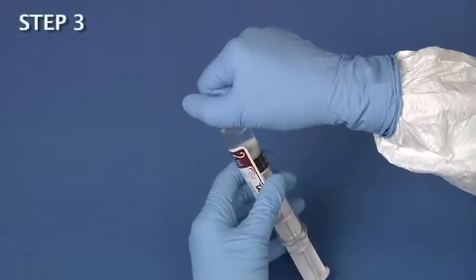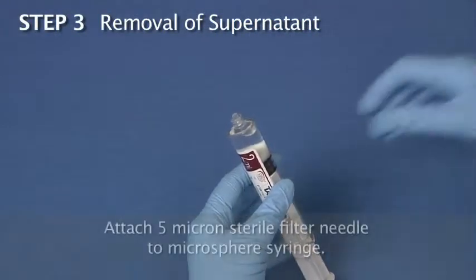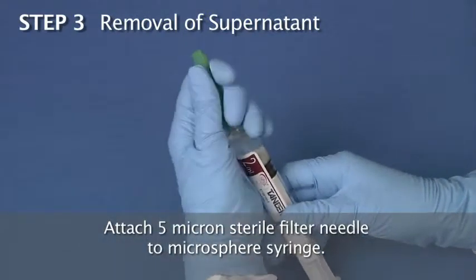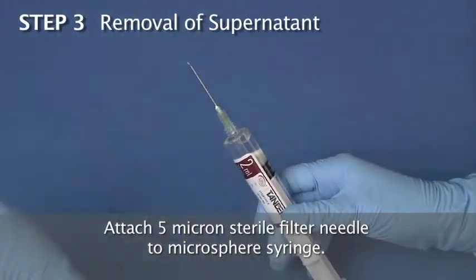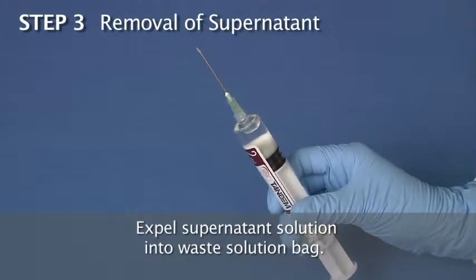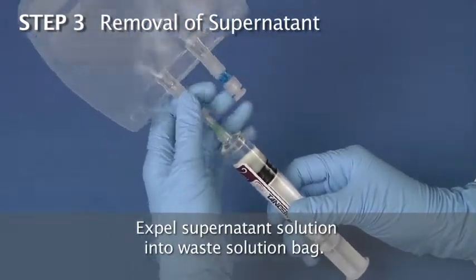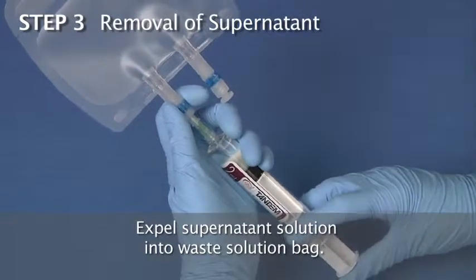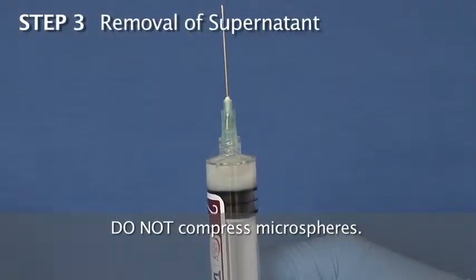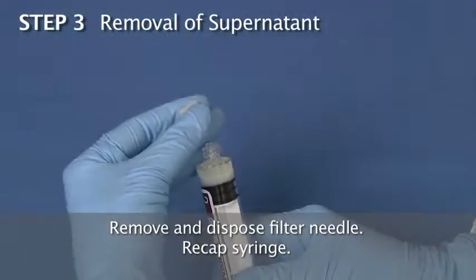Step 3. Removal of supernatant. Attach a 5-micron sterile filter needle to the microsphere syringe. Let the microspheres settle to the plunger. Expel as much of the supernatant solution as possible into a waste solution bag. Do not compress the microspheres. Remove and dispose of the filter needle, then recap the syringe.